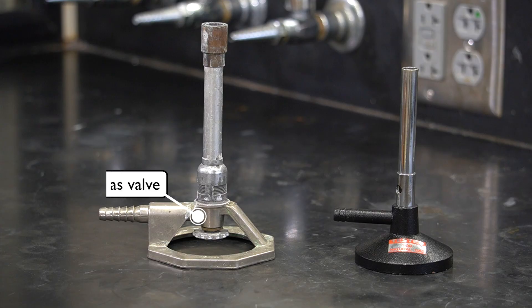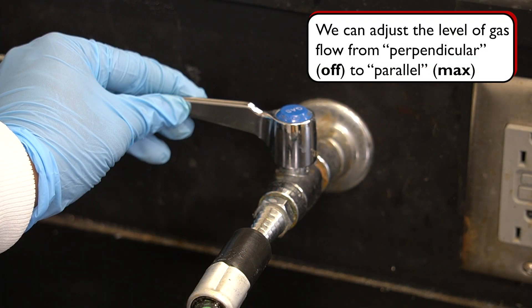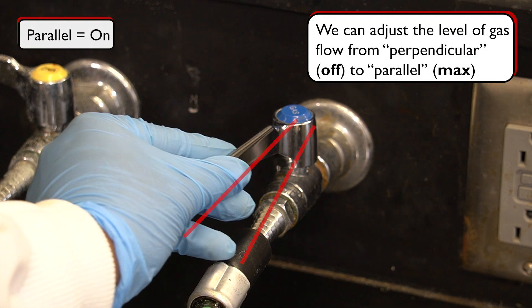Some burners also have a gas valve, which allows us to adjust the flow of natural gas and the size of the flame. That said, most burners in our lab do not have this gas valve. However, we can still adjust the flame size by turning the gas outlet nozzle on our workbench.